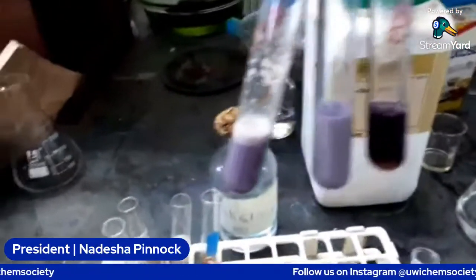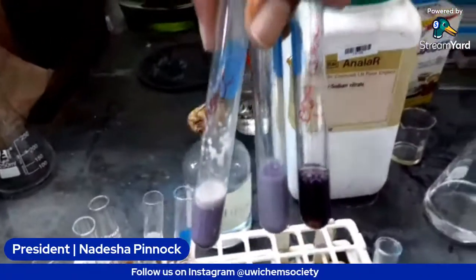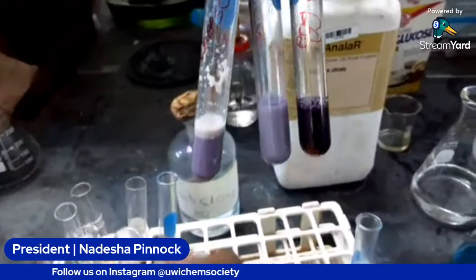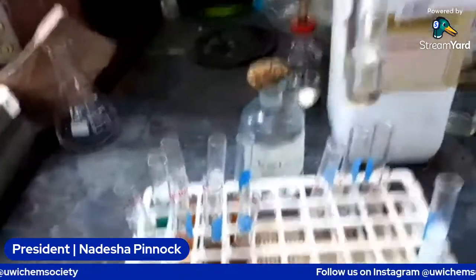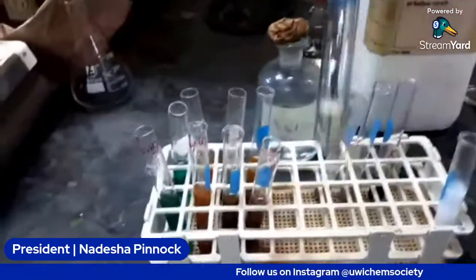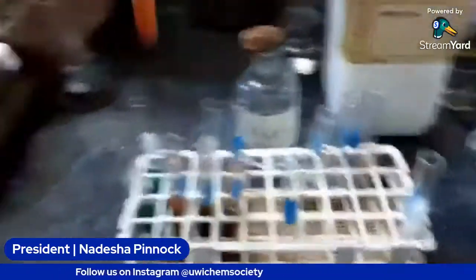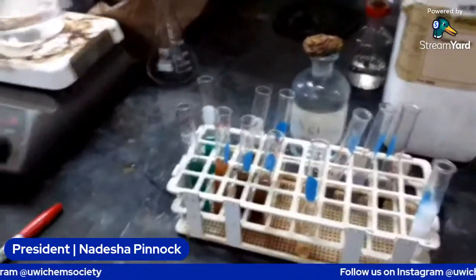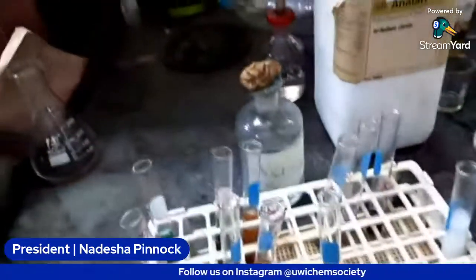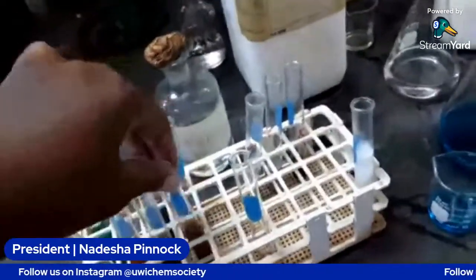The one in the middle is the milk, and the one on the right is the egg white. All of them are purple or mauve. This one is the sucrose, and we're going to do one with some syrup and one with some juice.